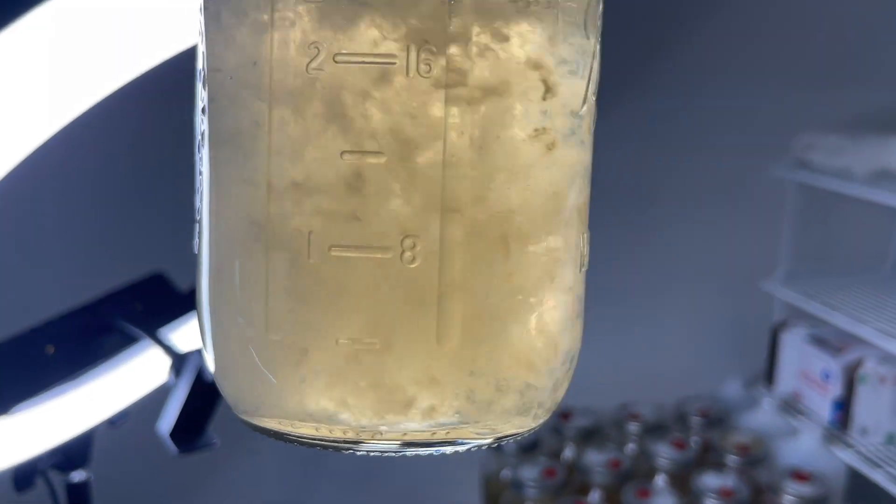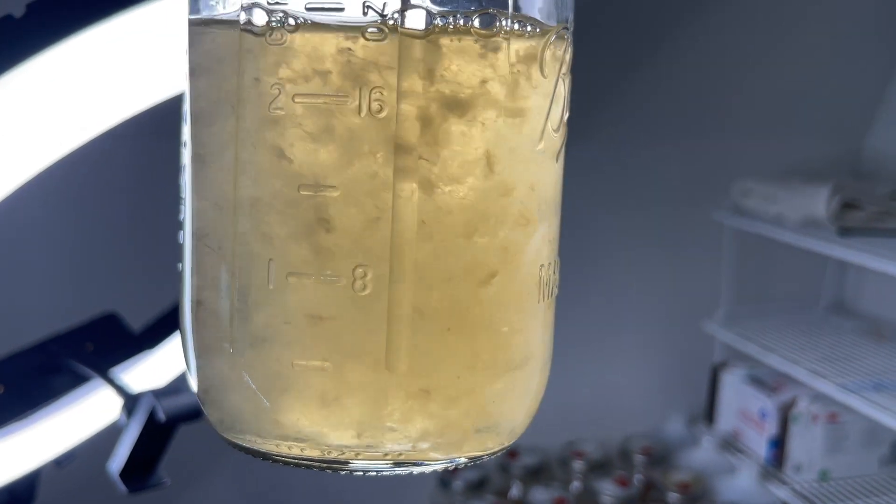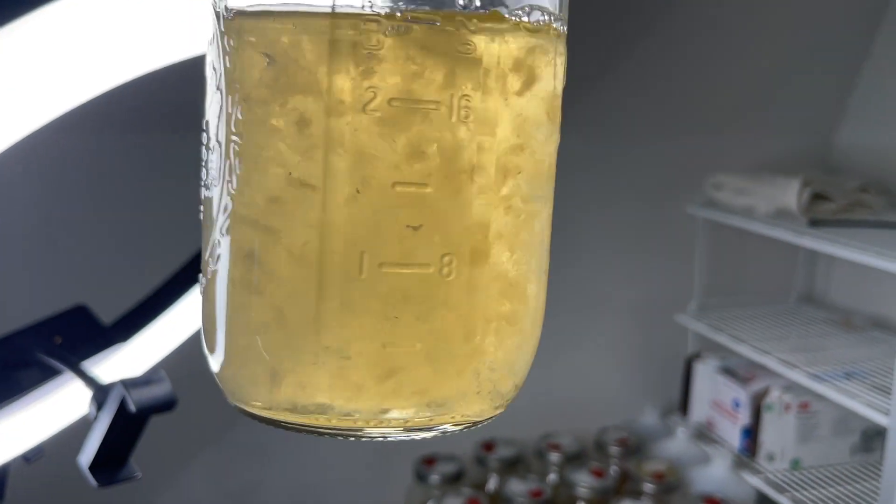Next we have cordyceps militaris liquid culture, which grows extremely thick and can form a pellicle on the surface if you don't stir it.